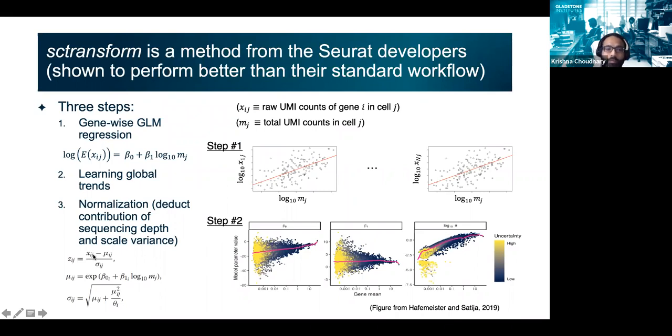So once again, instead of calculating the normalized expression from SCTransform, let's say we are using log normalization. Then once again we will use the mean of the log of the mean UMI counts for the gene and divide it with the predicted variance or predicted standard deviation for the gene given its mean log normalized UMI counts.